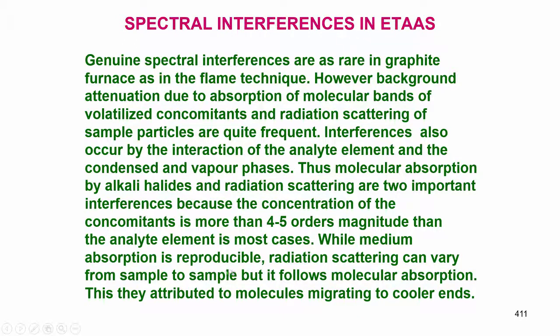While molecular absorption is reproducible, radiation scattering can vary from sample to sample, but it follows molecular absorption. This is what I have been trying to tell you throughout this slide presentation. They attributed this to molecules migrating to cooler ends. Only when they migrate to cooler ends do they not get removed so easily.